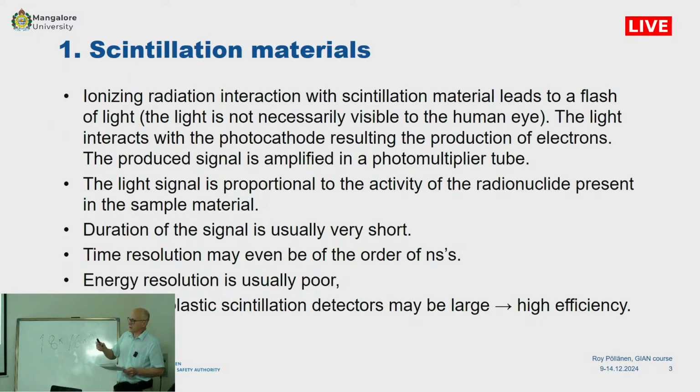All right, let's start with the scintillation materials. I talked about these things yesterday. Ionizing radiation interaction with scintillation material leads to a flash of light in the scintillation material. This light is not necessarily visible to the human eye.